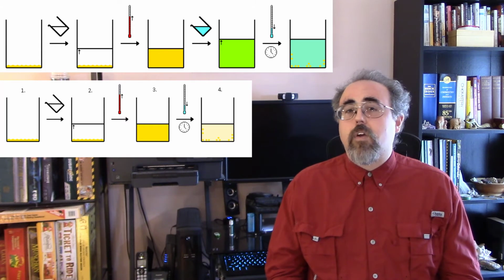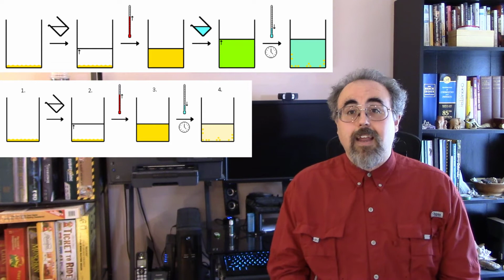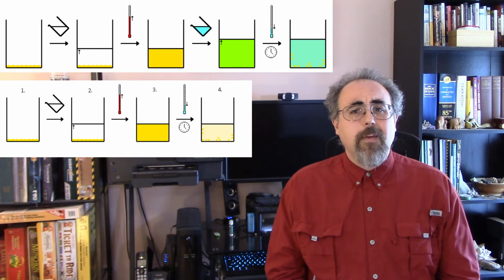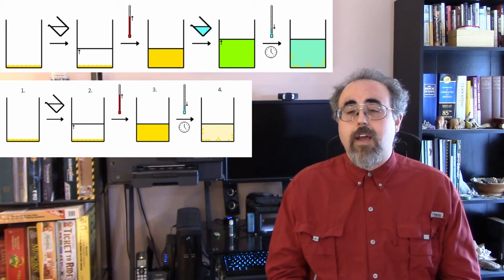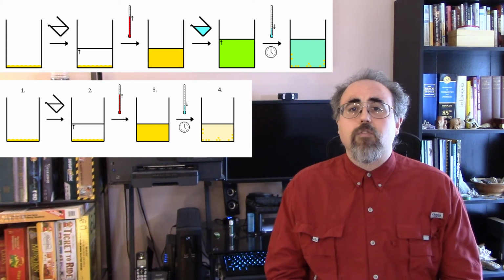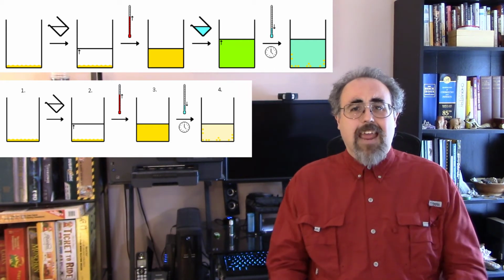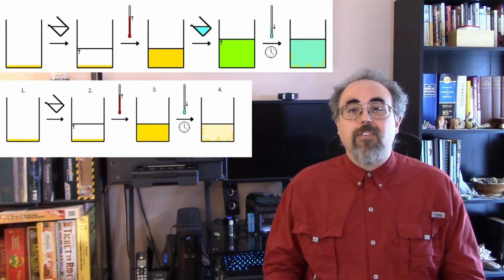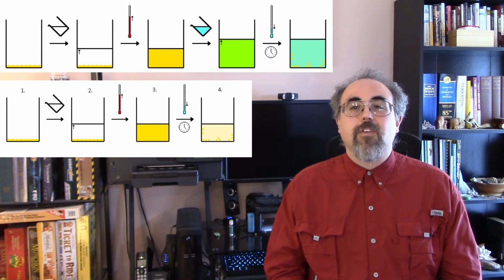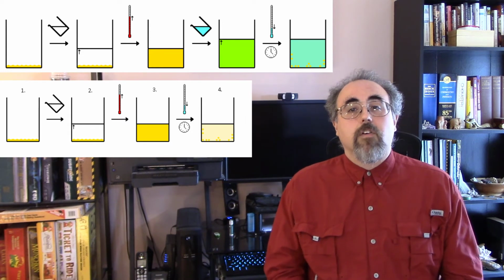In fact, you can do this step and not actually involve any filtering. If you have some chemical that you want to purify, you can simply dissolve it in a small amount of solvent, typically warmed, and then either add some other solvent to it so that it no longer dissolves as well, or you can allow it to cool down. Or I shouldn't say or, I should say and or. Typically you cool these things no matter what. And this way the chemical of interest will precipitate out, it forms some nice crystals, and all the other random chemicals that you were trying to clean from it stay dissolved in your solvents.